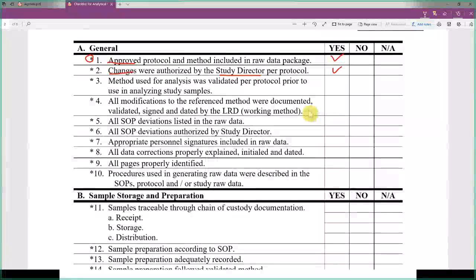So when you prepare your work in the laboratory, if you do have some change, the first thing you need to do is talk to the study director. That's why in the IR4 protocol, especially in the laboratory section in the last 6-7 pages, you will see a lot of wording like this: talk to the study director, get approval from the study director, communicate with the study director, contact the study director, etc. That's very typical. Then we can keep going on the details.